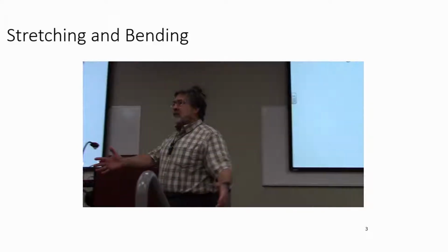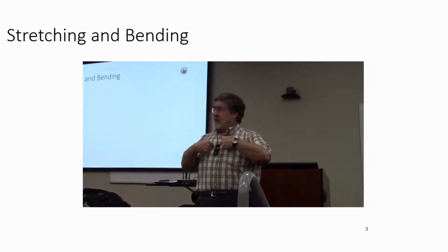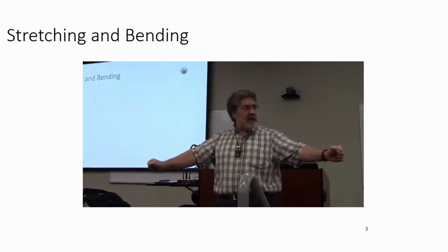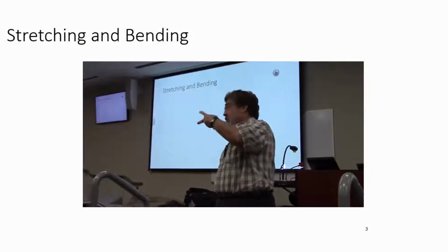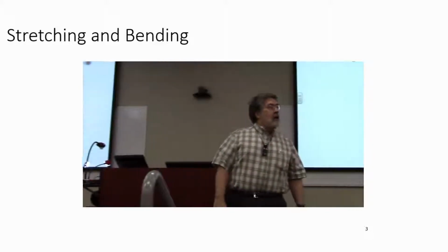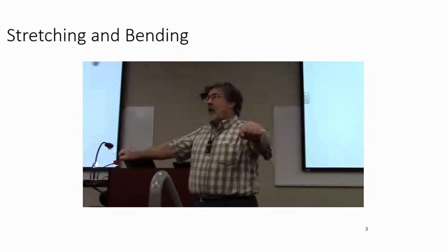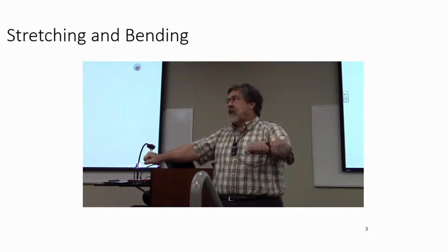When you think about bending, right, two hydrogen atoms, I'll play the part of the carbon. But two hydrogen atoms are going to be doing this relative to each other. Right? That's kind of a symmetric bend. We call that scissoring in the context of IR spectroscopy because it's doing what scissors do, right? Also, they can do this. Okay? So there's a lot of motion that can be going on. That's a bending where they're both doing the same thing at the same time, right? They're both going to the left or to the right, from my perspective.